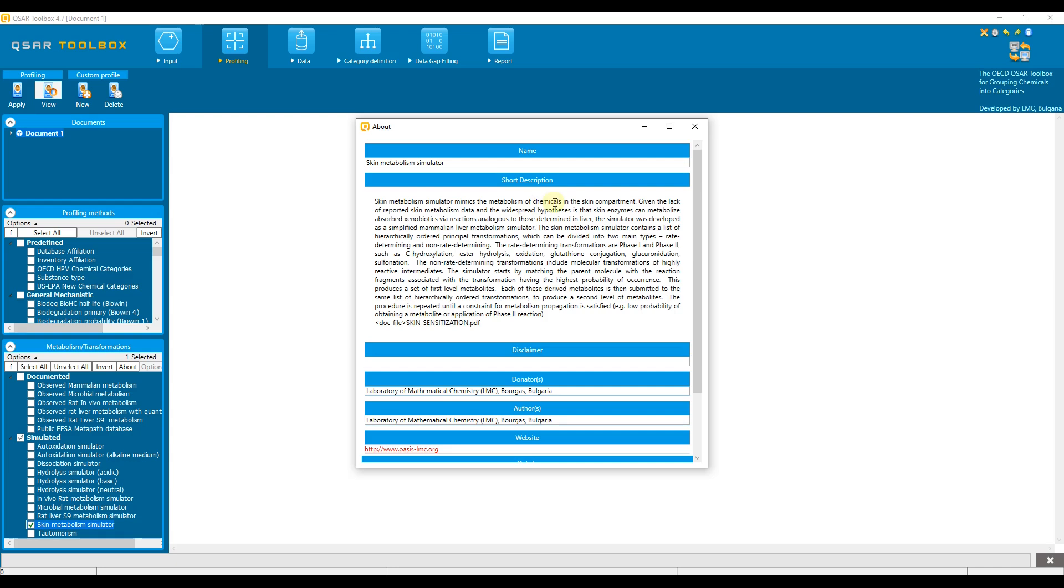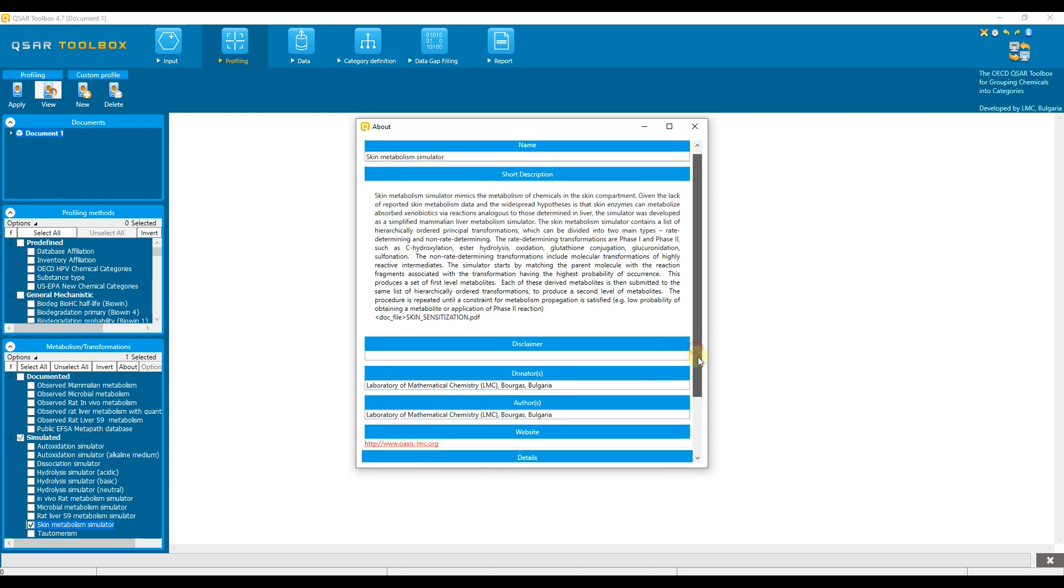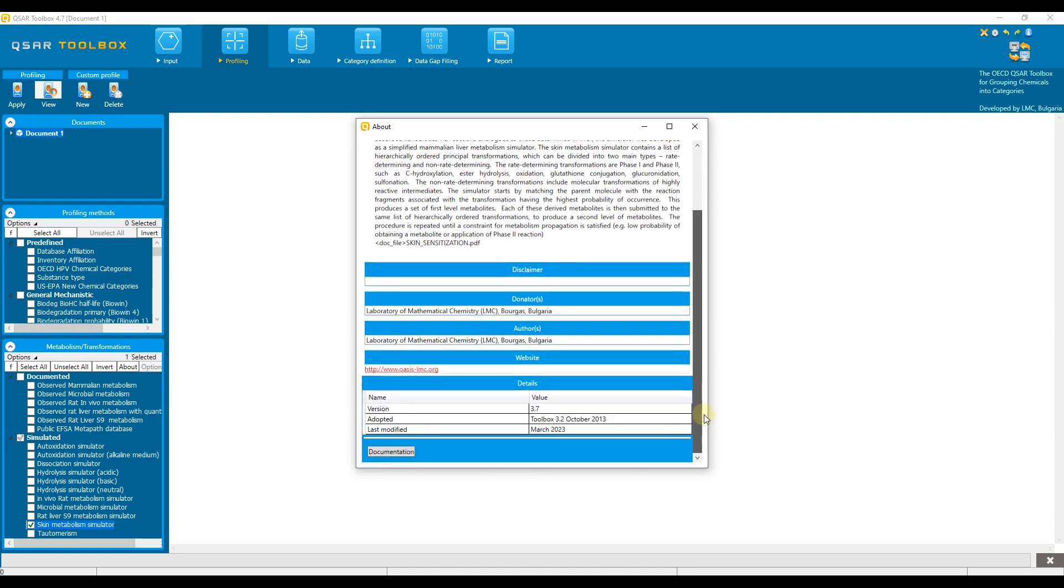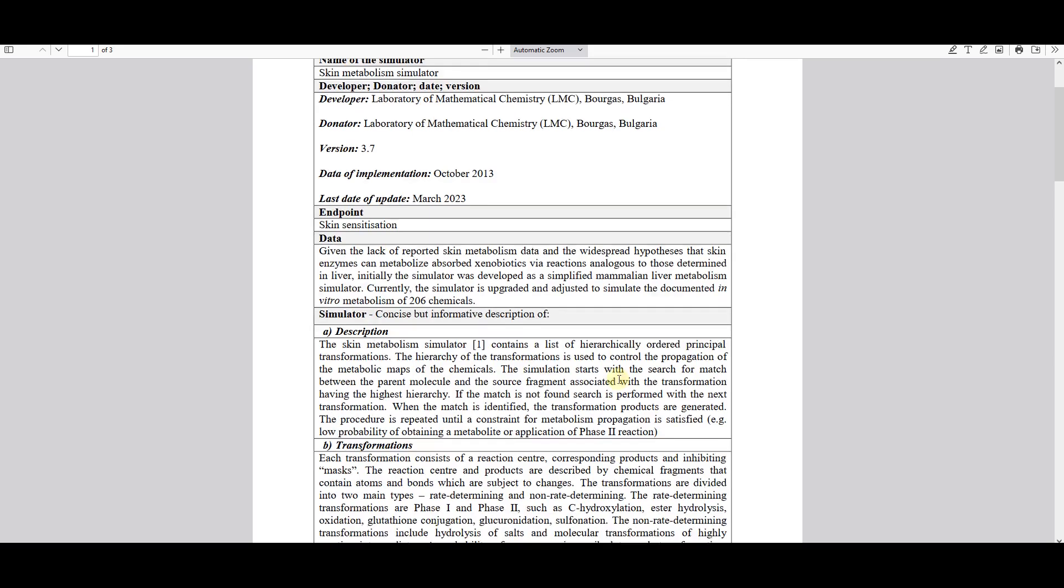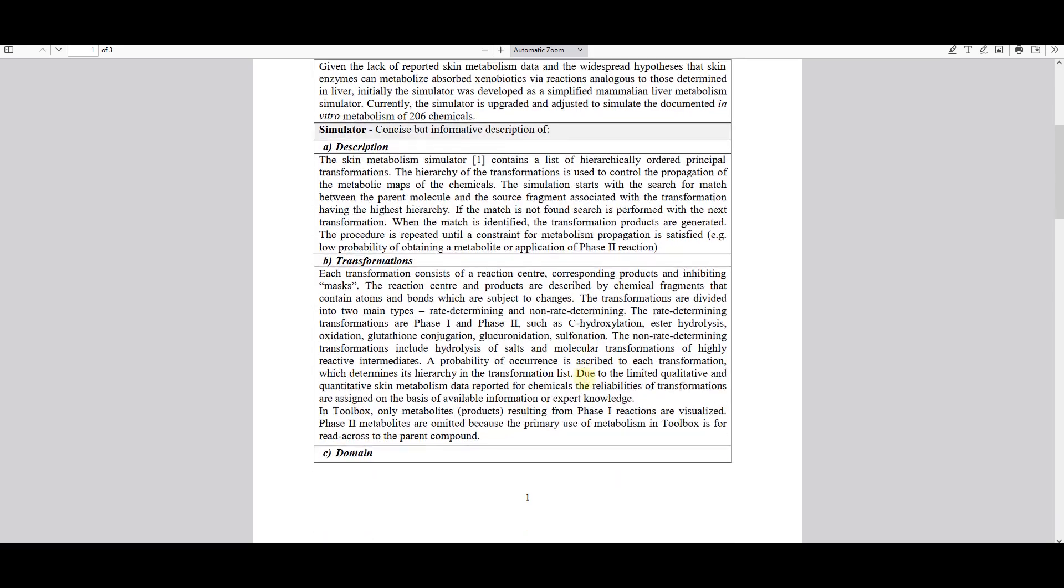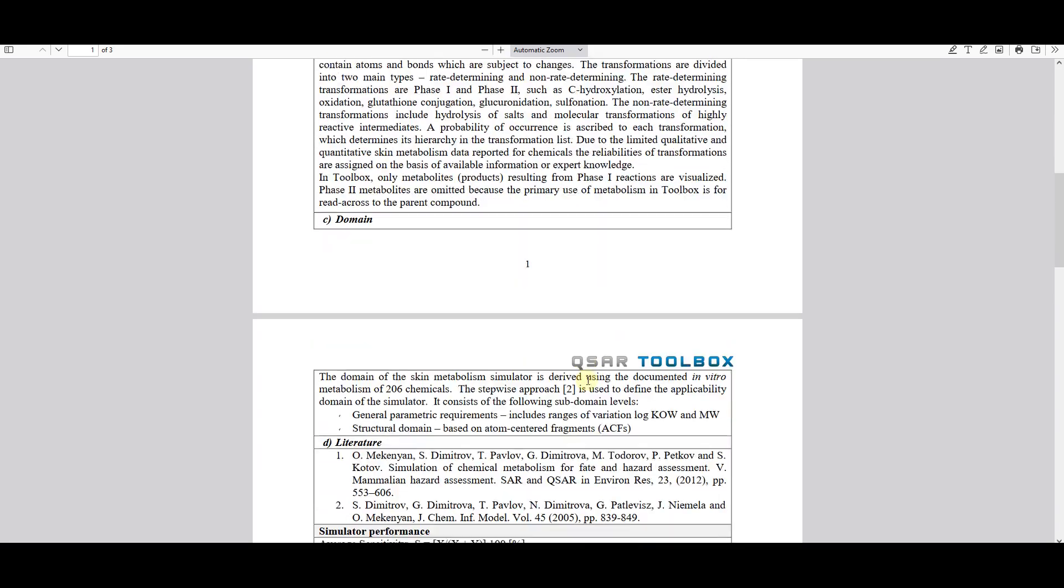Here we find a short description of the simulator, which also includes information about the developer, donator, website, and others. More details about the simulator can be seen by scrolling down and clicking on the documentation button. An additional file will open where you can find more details about the simulator.